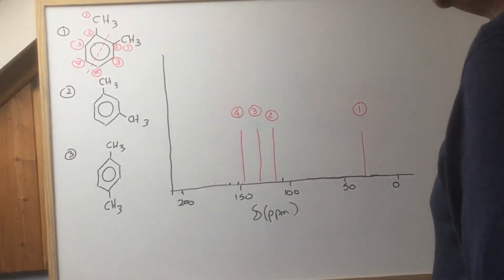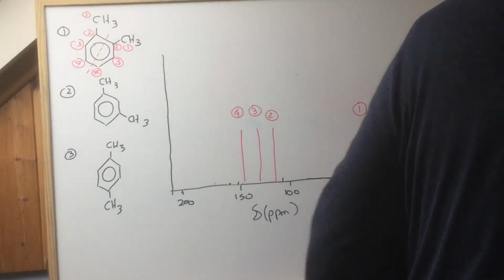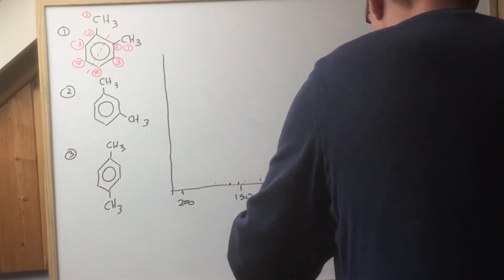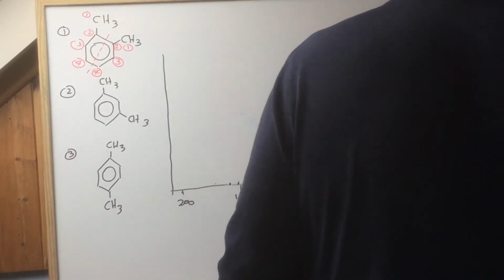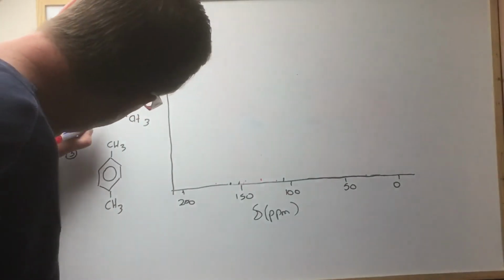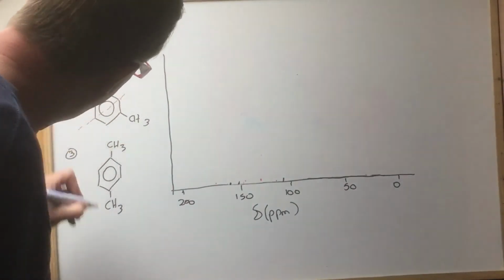Right, so armed with that and having some idea of what's going on, maybe you should be able to do this one and this one now, to look for, again, line of symmetry in the molecule is the key. So get rid of this. Okay. Line of symmetry, again, I've got to tilt my head round, guys. Okay. It's a bit screwy, but down here. Right, so rock and roll.